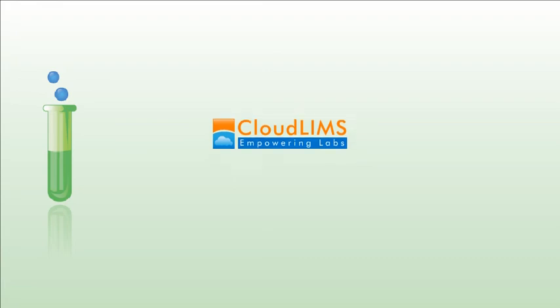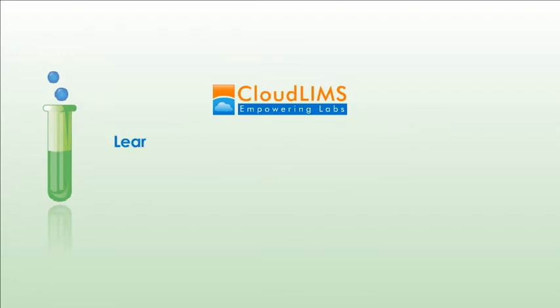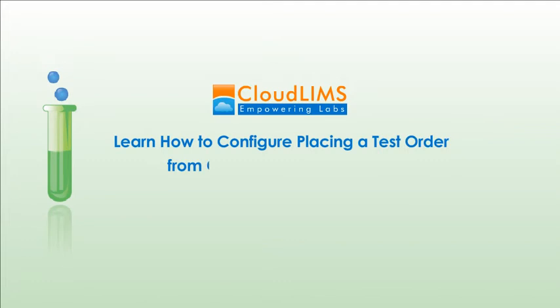In this video, we will demonstrate the necessary settings you need to make to enable patients to place a test order via CloudLIMS Patient Portal.